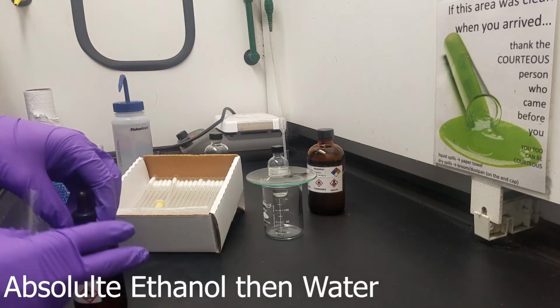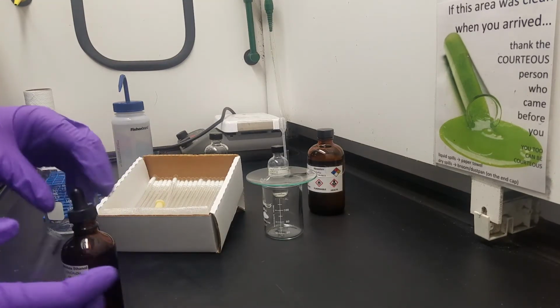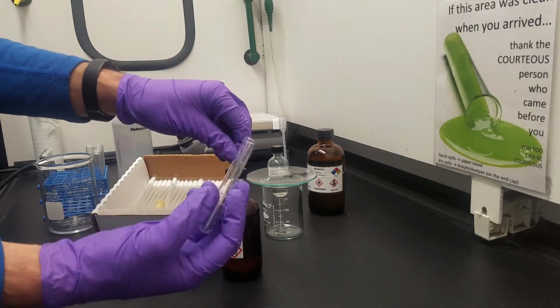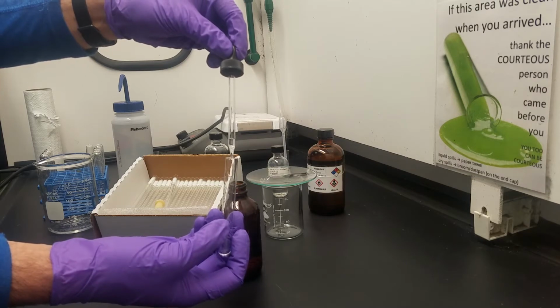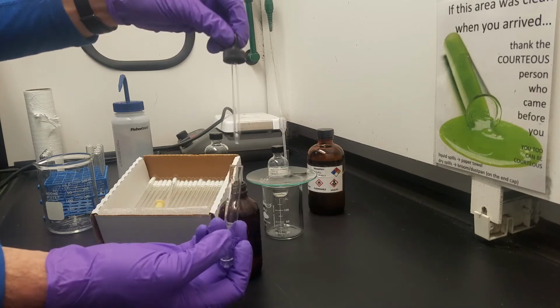So we're going to start with absolute ethanol and then water. That absolute just means it's super concentrated, that it's only ethanol. That's the only reason behind that name.